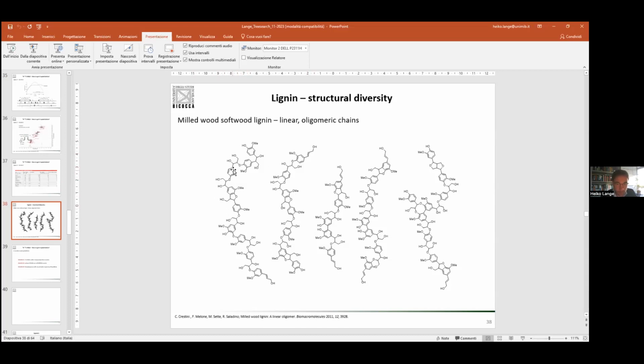Then for seeing all the rest, in terms of the aromatic ring structure, the aliphatic units that are connecting basically the single aromatic rings, we run an HSQC. Because in the HSQC, we see only the carbons that are connected to at least one hydrogen.